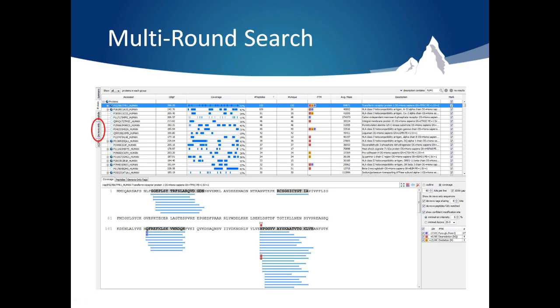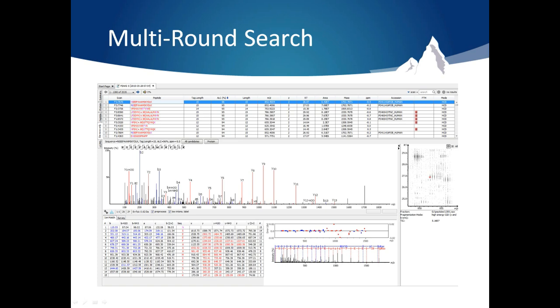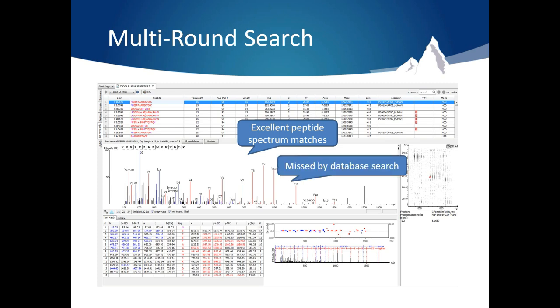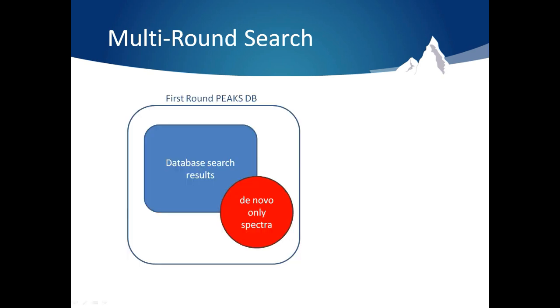This tab contains spectra that cannot be matched by PEAKSDB, PEAKSBTM, or SPDR. However, using de novo sequencing, these spectra can still have excellent peptide spectra matches. This makes us question why these good peptides are missed by database search. Multi-Round Search gives us the opportunity to answer that question.